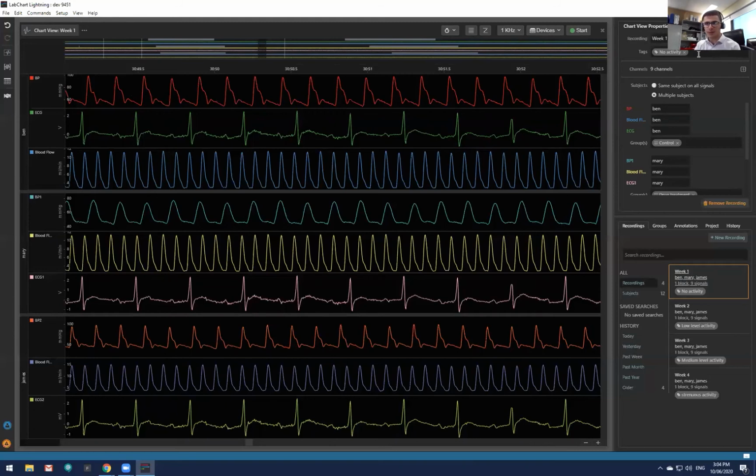If you have a lot of experiments done, let's say you're a month down the track, about to write your thesis, and you want to start getting on the results. Having these tags is really important. If you know specifically what you're looking for, like which ones had no activity, or which ones were sick, or which had different dosages, I can look for that particular tag and find exactly what I'm looking for. So these are really important for data management. And that's what we have here. These points, the no activity, the control, drug treatment, sick, we can all search for these.